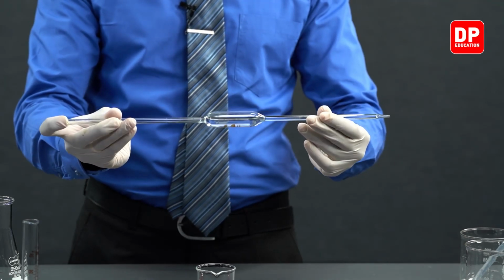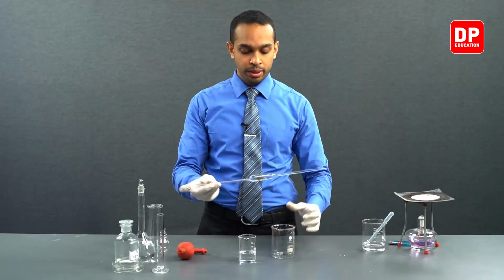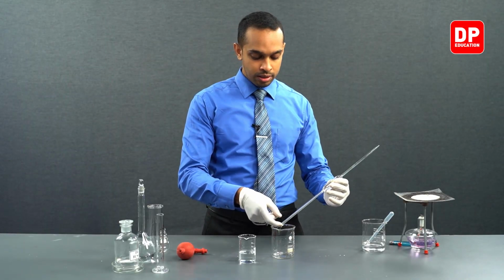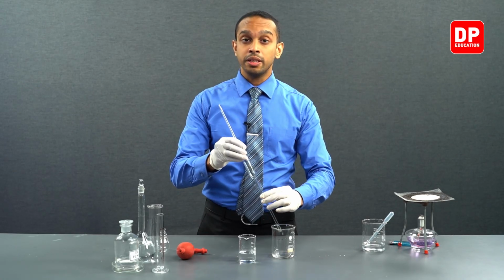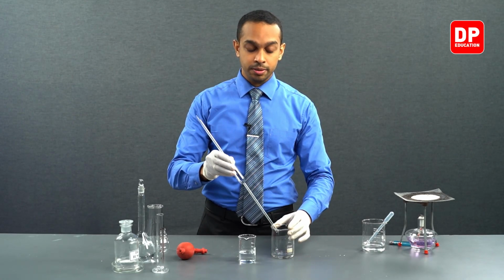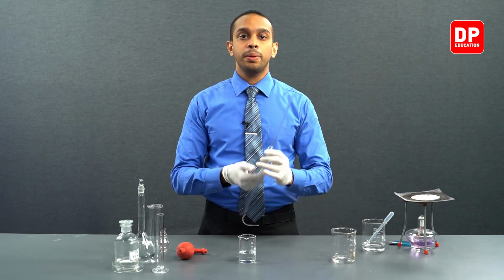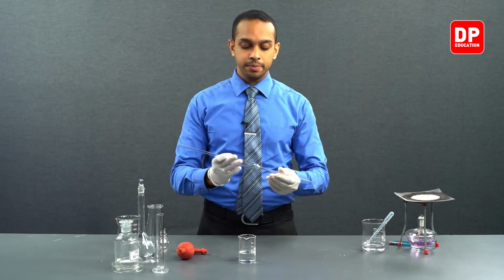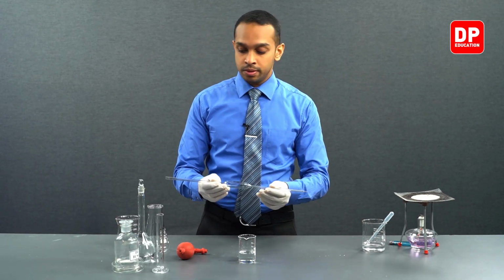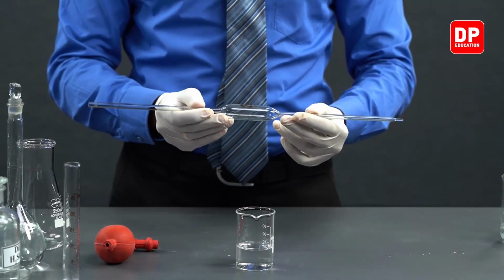Once you are done, you can take another new beaker and discard the solution that you used to wash the interior of the pipette. Now we have completed the washing of our pipette. Now we can move on to taking some amount of solution into this pipette.